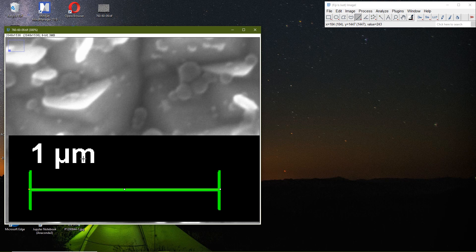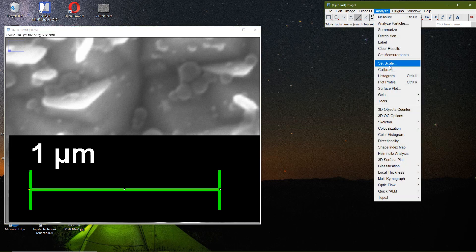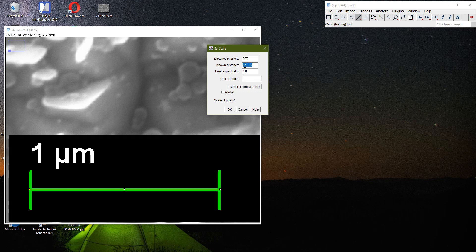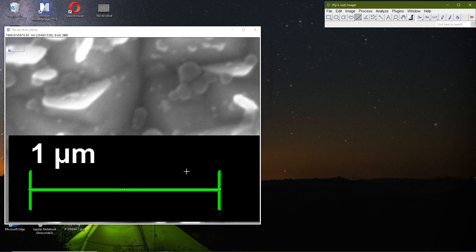I go to Analyze > Set Scale. The known distance is one micrometer. I set the distance in pixels — actually I prefer to enter 1000 nanometers because my particles are very small. It depends on what unit you tell the software.